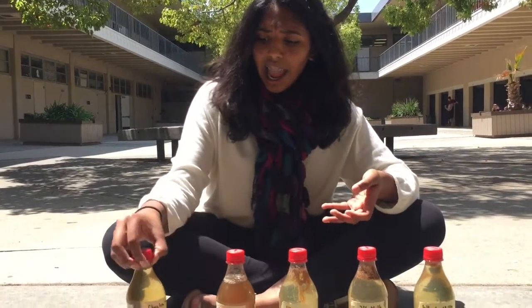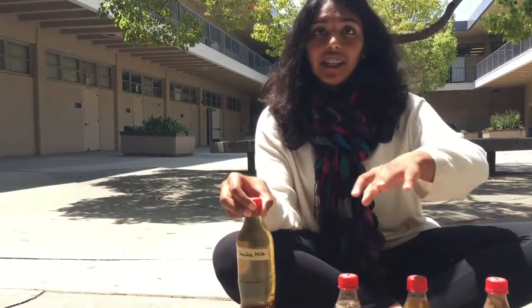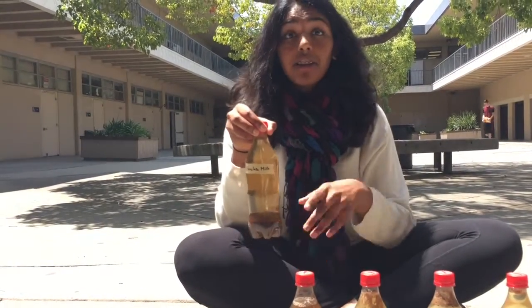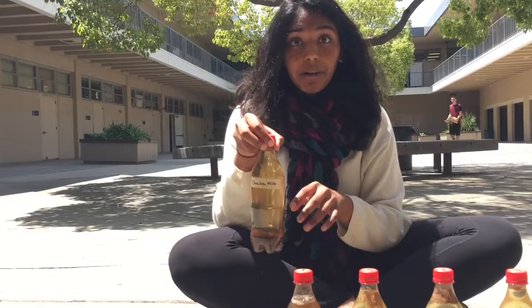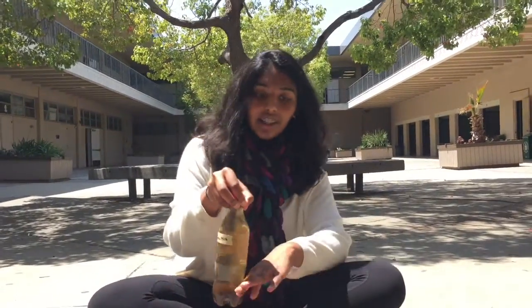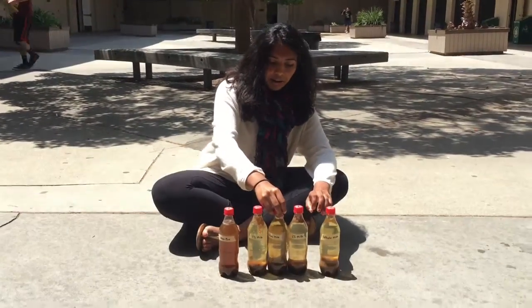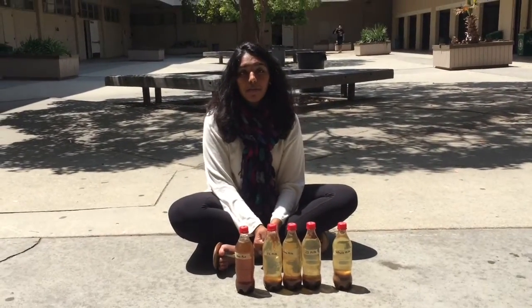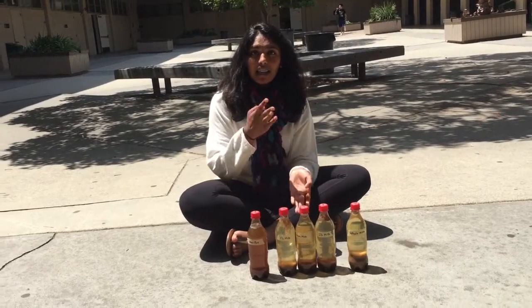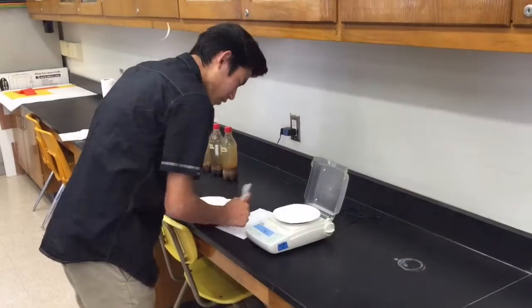And we just had this awkward chocolate milk sample, so we were just trying to test all of these out, because the chocolate milk didn't really have a milk fat, so we were going to figure out where chocolate milk fit on this spectrum. So we figured out that it would fit between the 1% and 2% fat milk, because it has the calcium content and precipitate in between those levels.